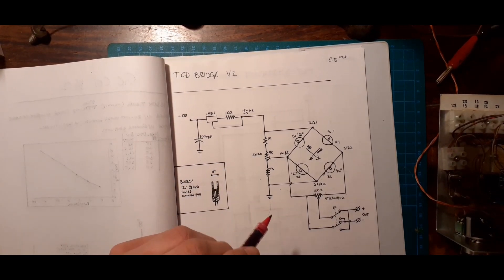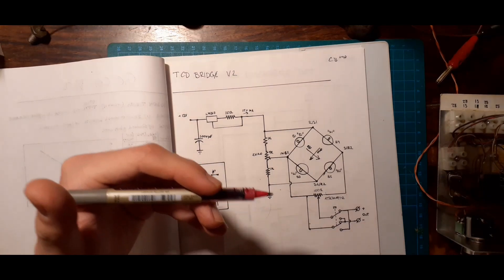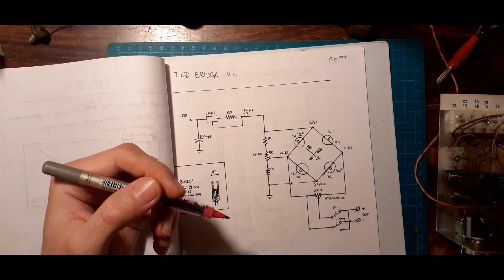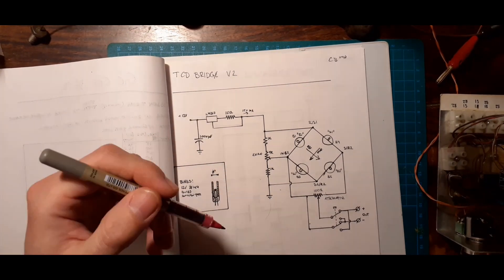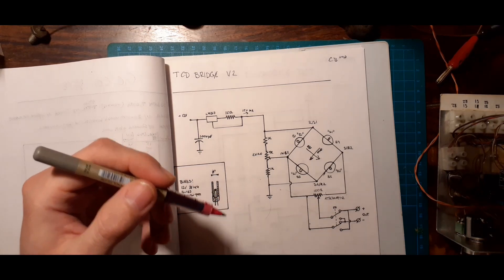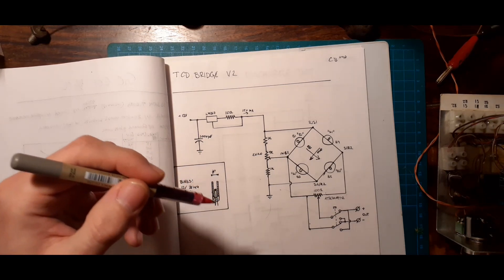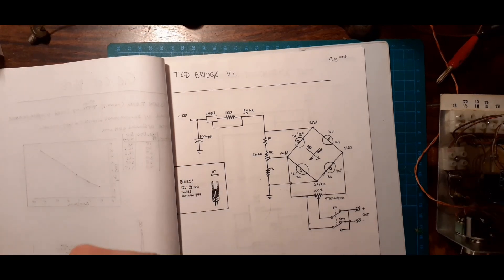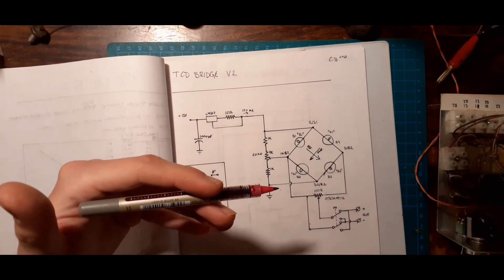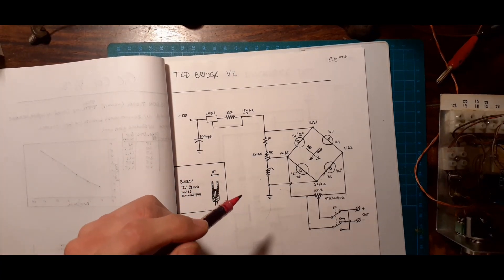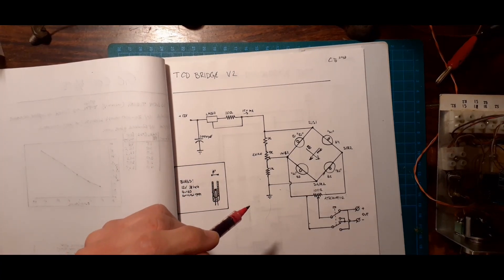So basically, you'll have some kind of heated filament, and you'll have your carrier gas passed over it, and it'll reach some kind of equilibrium. Then when some sample flows over it, the thermal conductivity of the gas will change, the amount of heat being wicked off of these elements will change, they'll increase or decrease in temperature, and the resistance of the filaments will change, and thus the current through them will change. And you can detect this as a voltage drop.